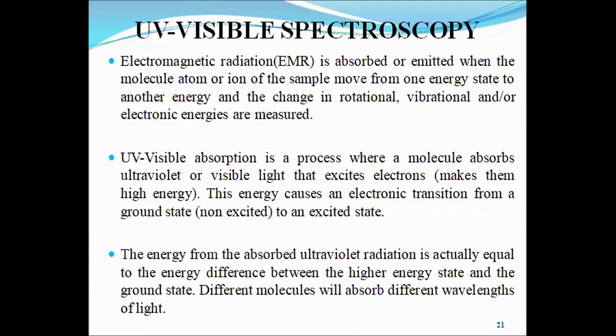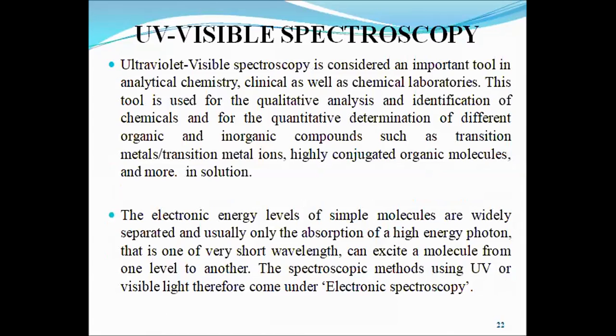The electronic energy levels are widely separated and only high energy radiation, that is, radiation with short wavelength, can excite a molecule from the ground state to the excited state. Therefore, this spectroscopy is also termed electronic spectroscopy.